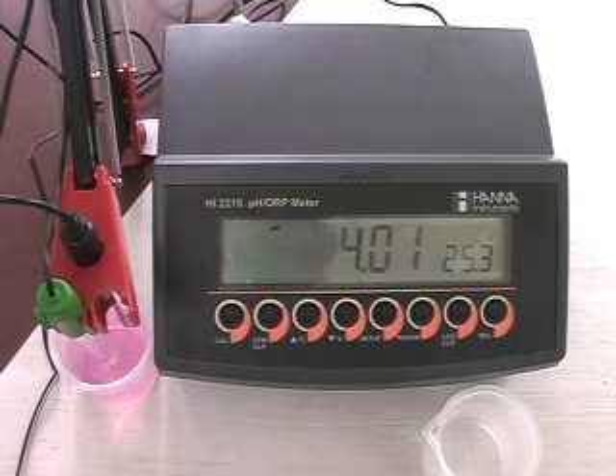Basically, HI2215 is a microprocessor bench pH meter which has a 5-point calibration facility. Today we will see how to calibrate your meter for pH 4 and 7.01 buffer solution. Basically, this is a 2-point calibration, and I will show you how to perform 2-point calibration.